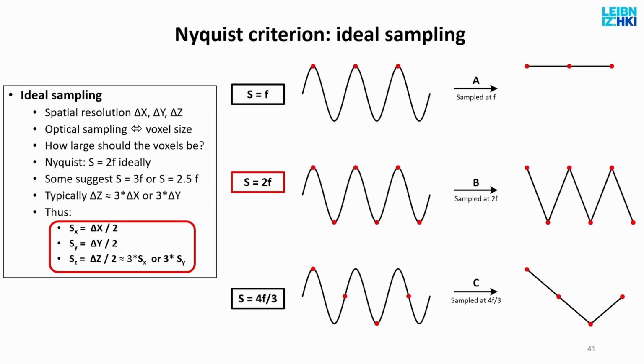You just see a flat signal like that. Now, if you sample the signal at twice the frequency, then you will get sampling points near the peak and near the bottom, here and here and here and here. So you will get the periodicity. You will not get the signal itself. For that, you would have to sample it much more frequently.